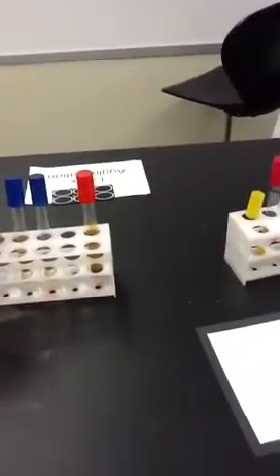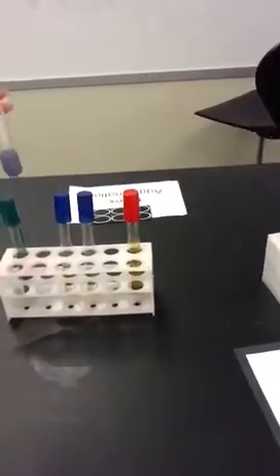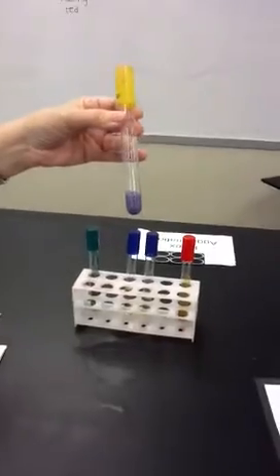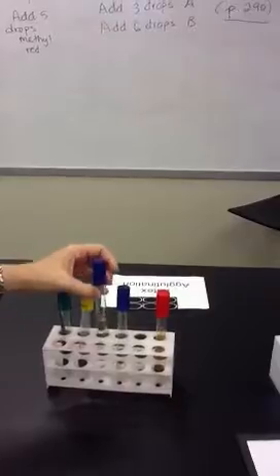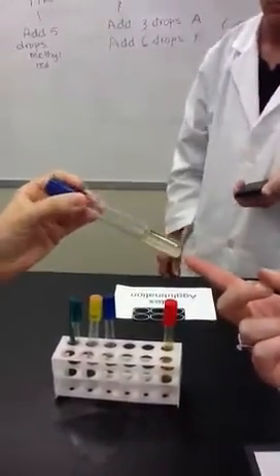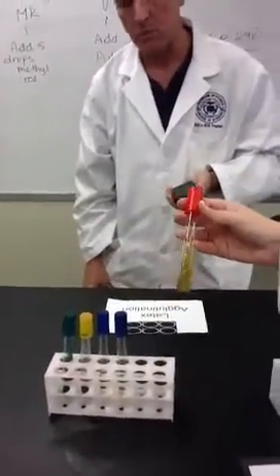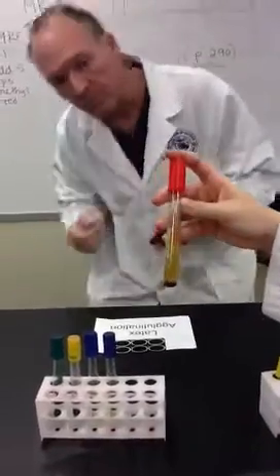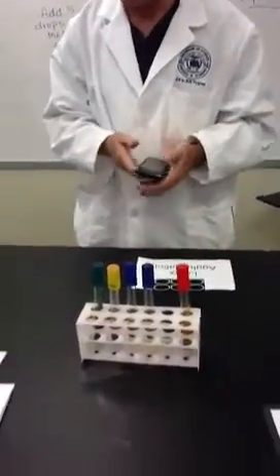And this is that crappy entero tube? Oh, no. These are the citrates. Citrate. Oh, that's a citrate negative. That's a citrate negative, yeah. This is a litmus before... that's a control. Pick up the control. Yeah, that's purple. Yeah, that's a litmus control. Okay. What was your feeling about the motility? These are... Those look like controls. That's a gelatinase. That's negative. Gelatinase negative. This is gelatinase positive. Liquid is positive. This is a cyanose positive for hydrogen sulfide, and... Yellow is acid. Acid acid? Acid acid, yes.